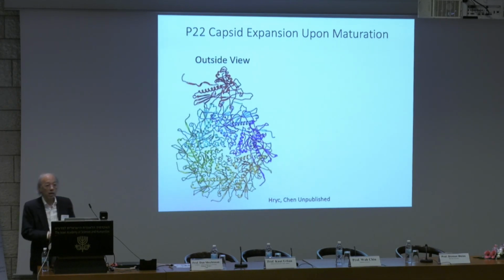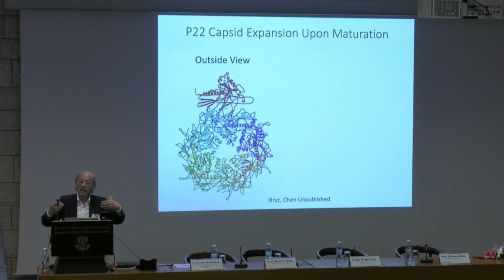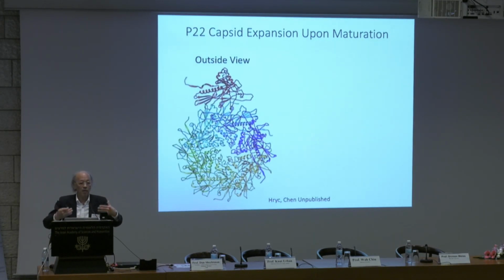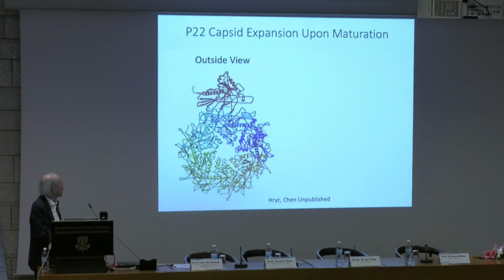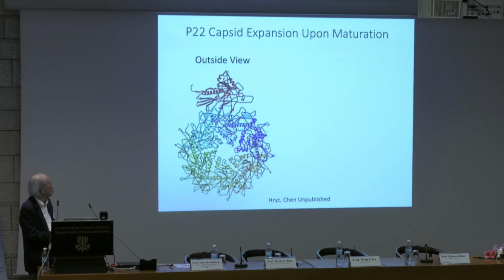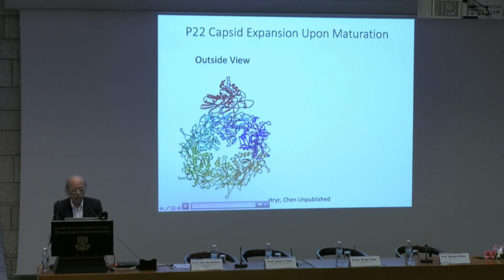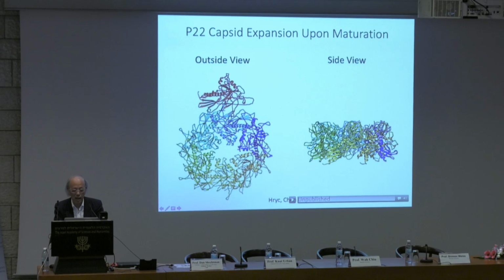It's not surprising, because after the DNA comes in, something has to be closed up. Otherwise, the enzymes in the cell will digest all the DNA. So it makes sense that there is a large conformational change. Now, this is a top view, and then I'm showing you the side view.